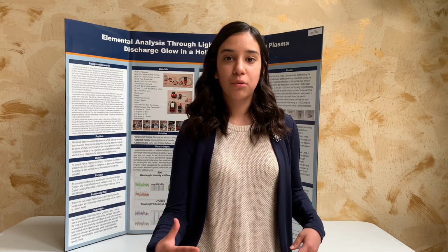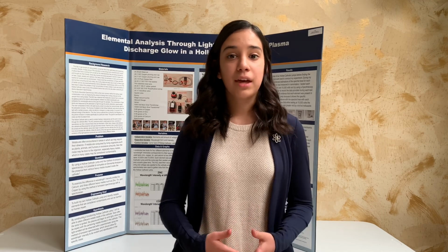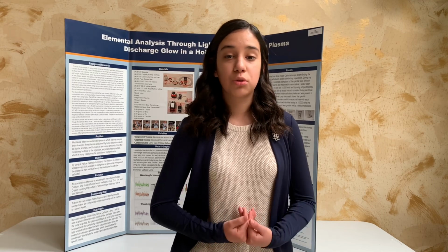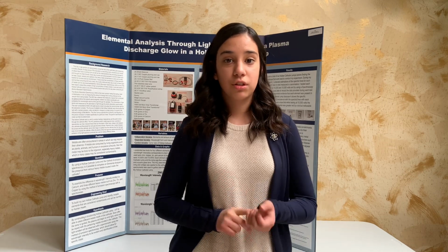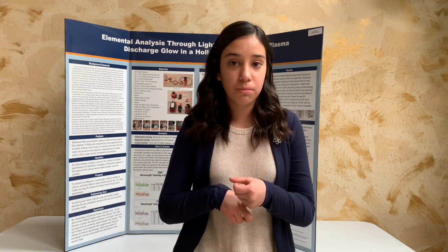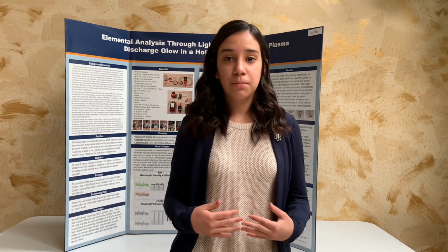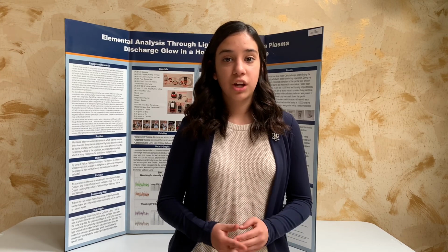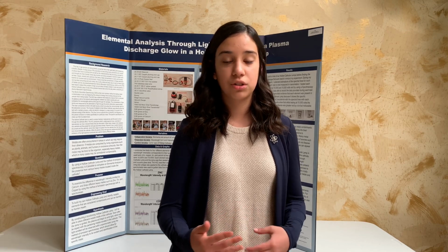And as people become more mindful of the heavy metals and contaminants they bring into their homes, they can use different methods to identify what is contaminating these various materials. They can use the 2 different methods of either emission spectroscopy or atomic absorption spectroscopy. And as for me, I was able to build my own hollow cathode lamp with which I can identify various heavy metals that can be contaminating different materials.